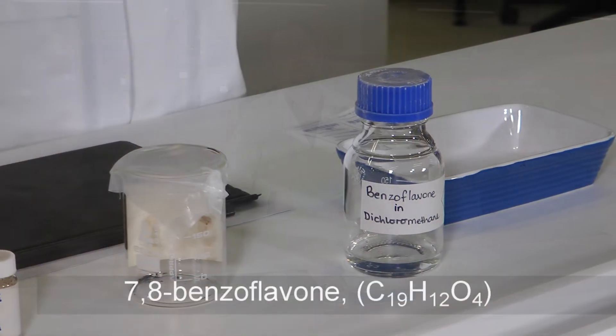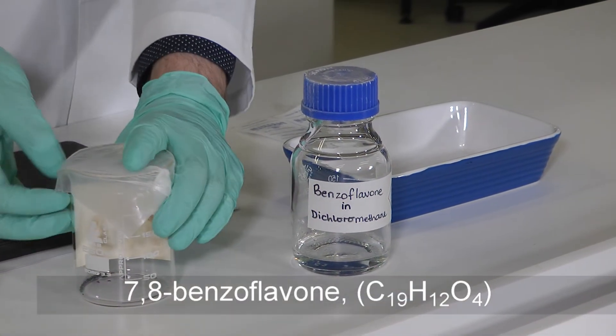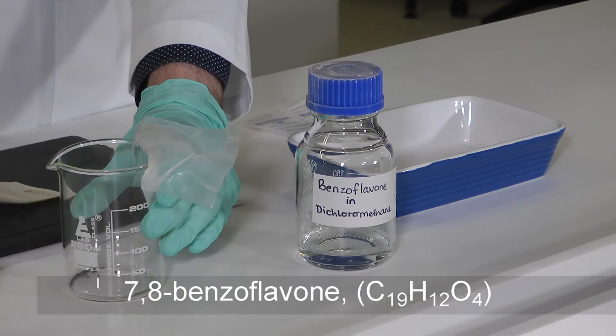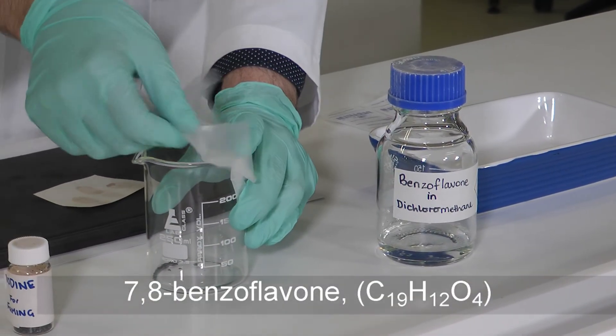The fixing solution that we're going to use today is 7,8-benzoflavone. All we need to do is take our iodine-treated finger marks out of our beaker and seal that back up so we don't get any more of those fumes.